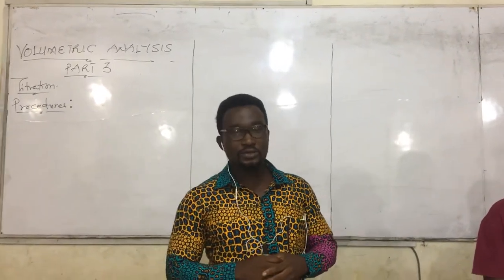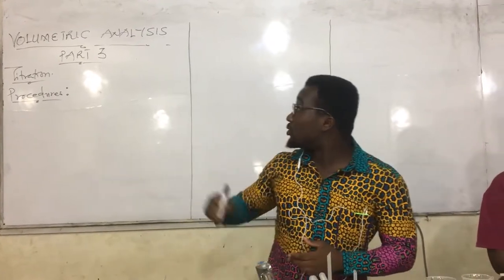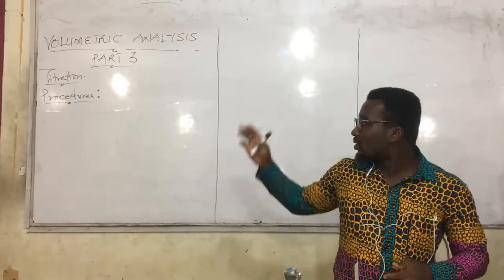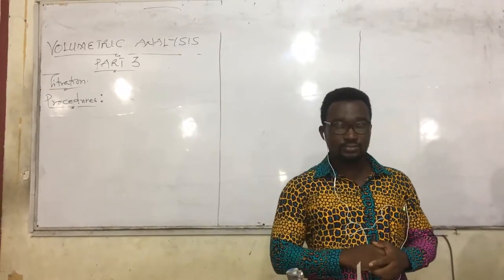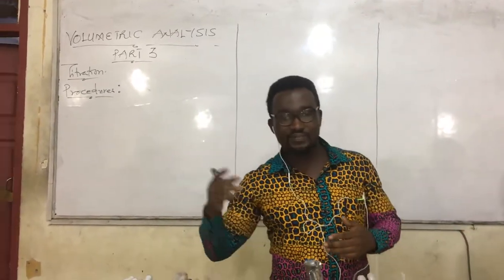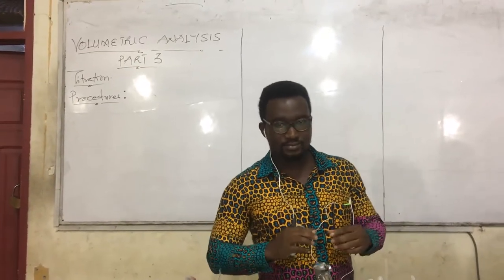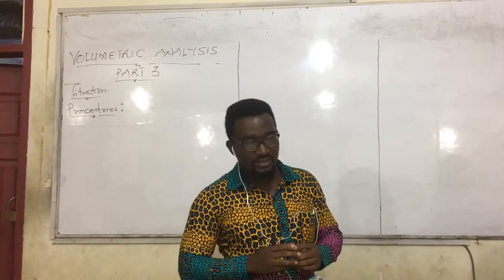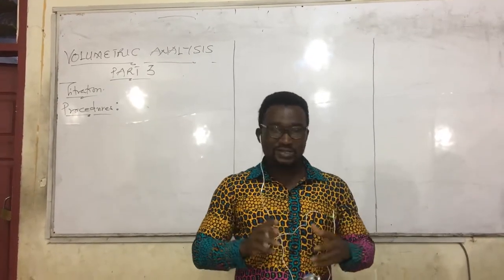Today, we are going to begin with our tutorial. We are going to look at volumetric analysis part 3, which deals with titration. We have already discussed from our previous part that titration is an art. Today, we are going to look at the art, the rudiments. What is entailed in the act? That is what we are going to do today.